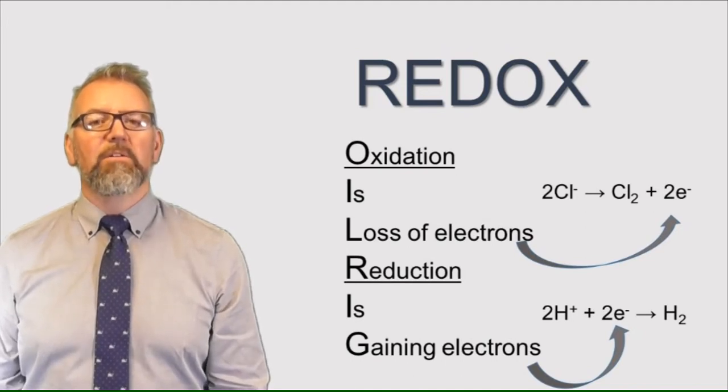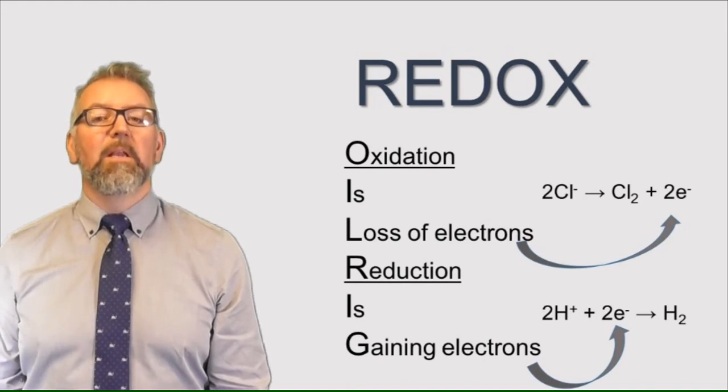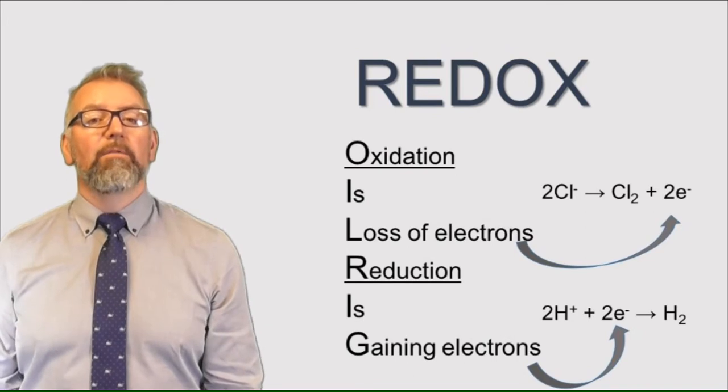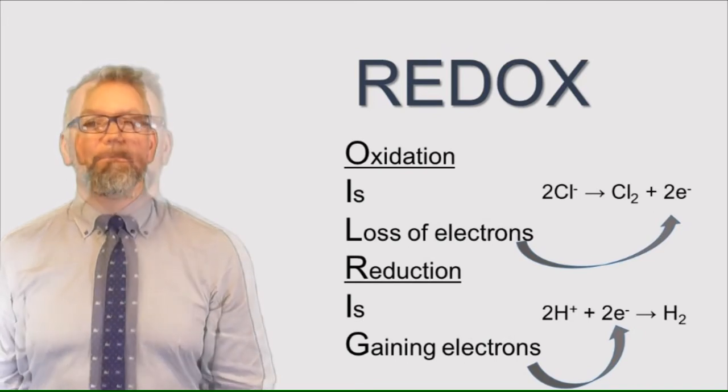At the negative electrode, the positive ions are reduced. The ions gain electrons to become atoms. In the case of hydrogen, 2 atoms of hydrogen will join together to form hydrogen gas, H2.